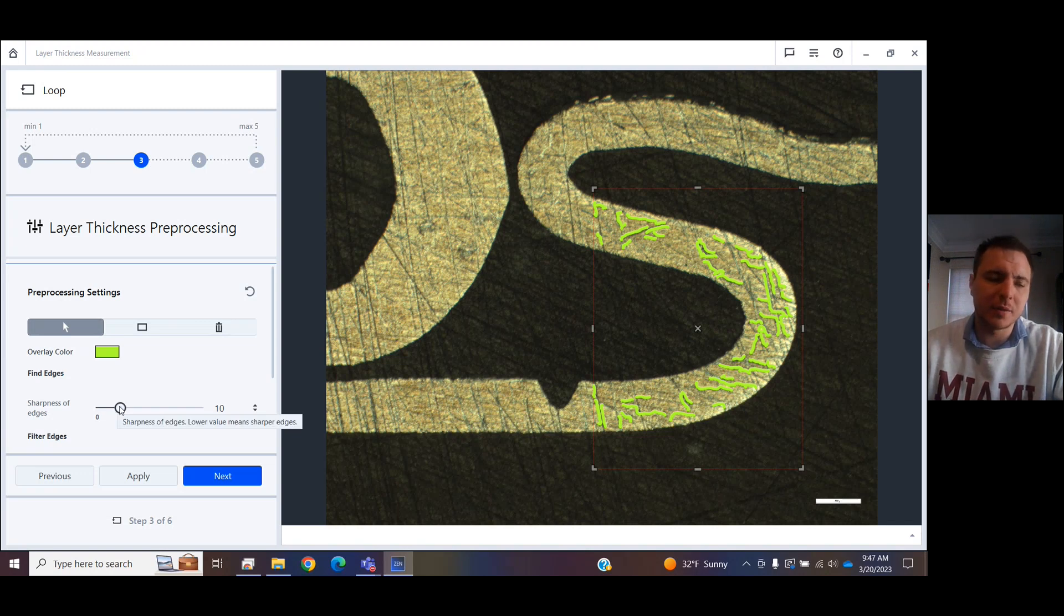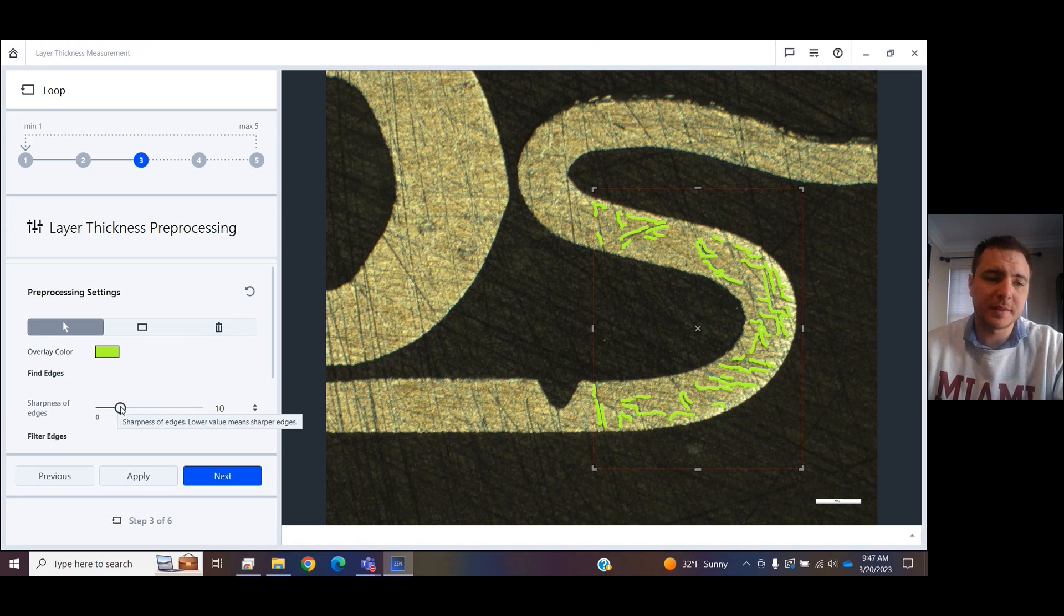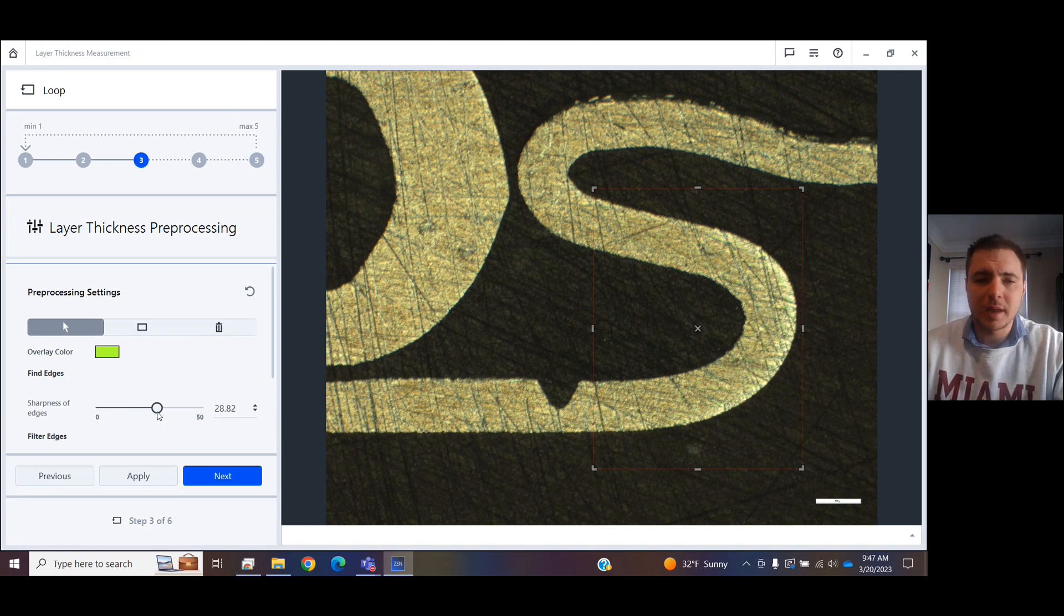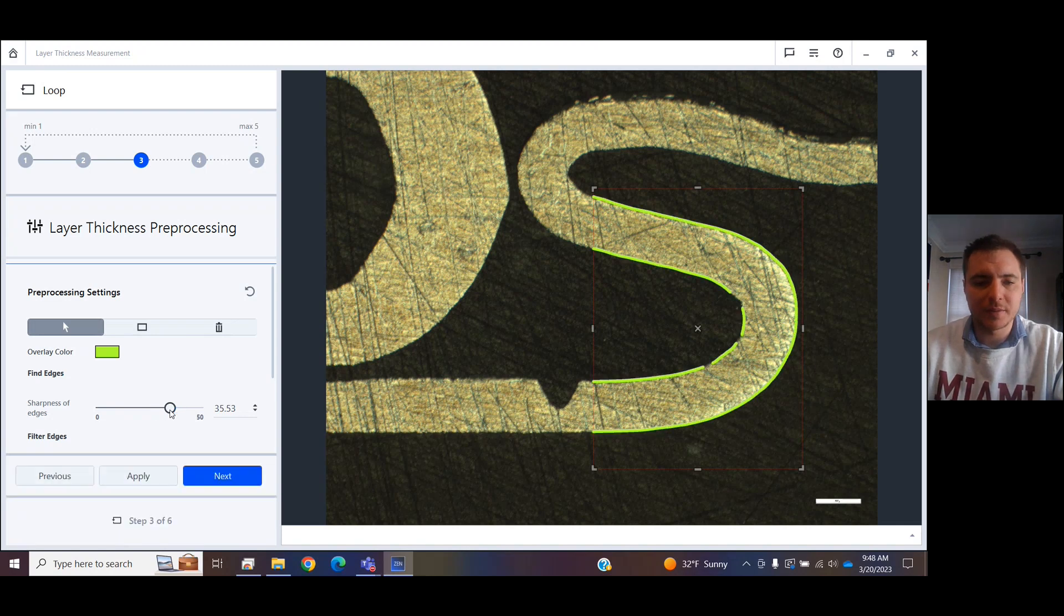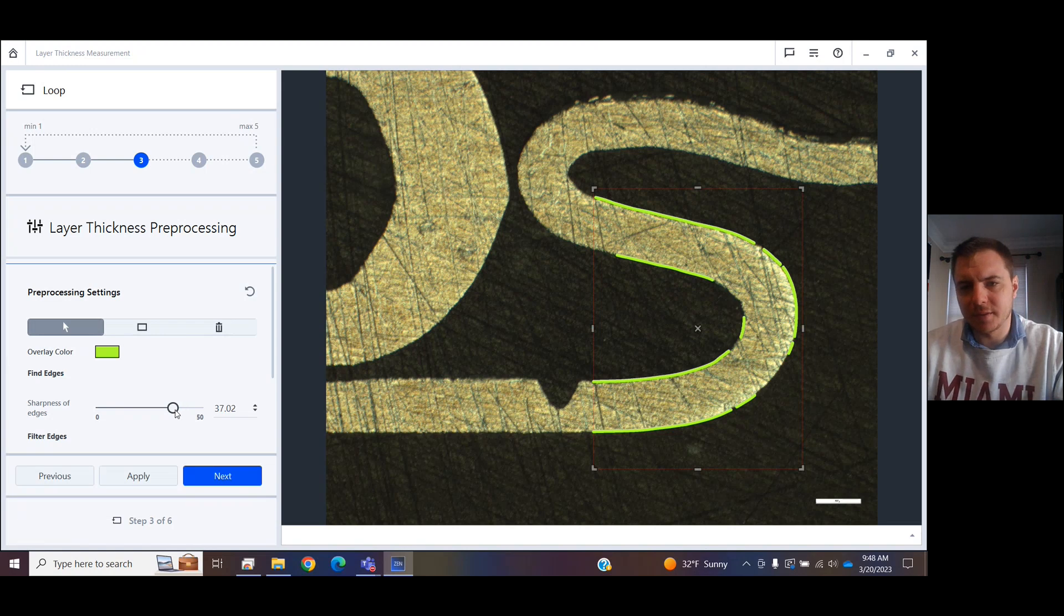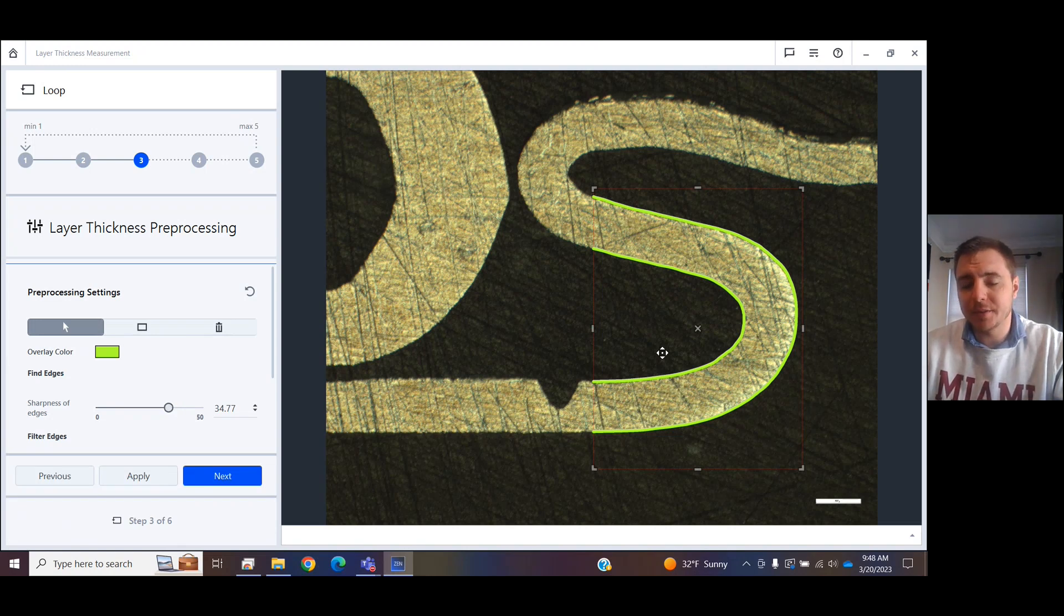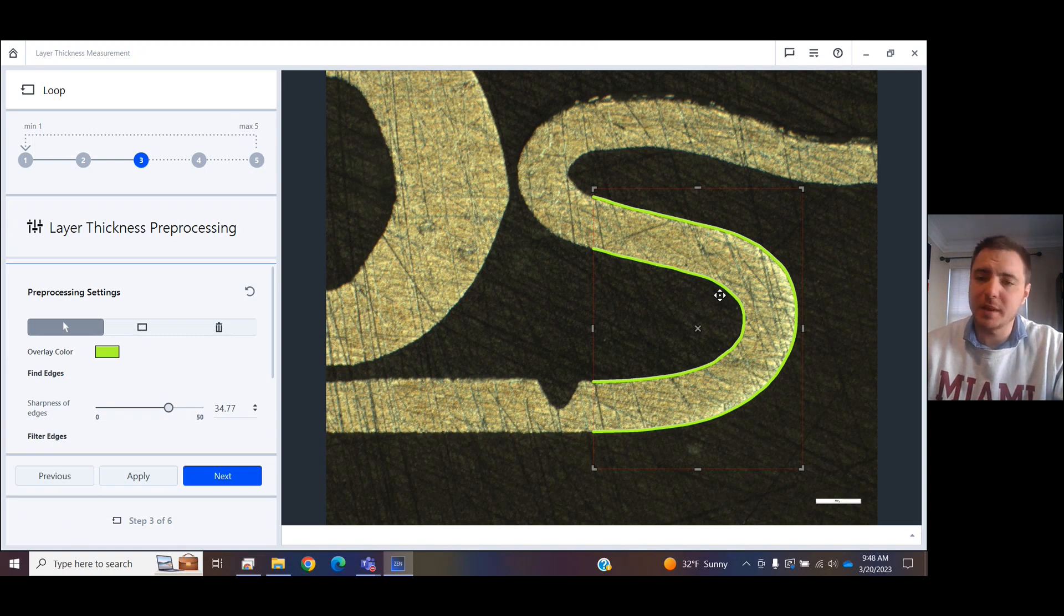So what I need to do is I need to play with this Sharpness of Edges filter. And if you can get it to the right spot, the software will identify. But you've got to find the sweet spot in there. You see that it's doing a better job, and I'm getting closer in here. There we go. Now it has found the edges of my layer that I want to find the mean average of.